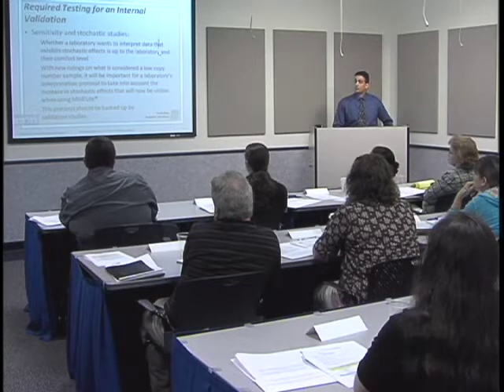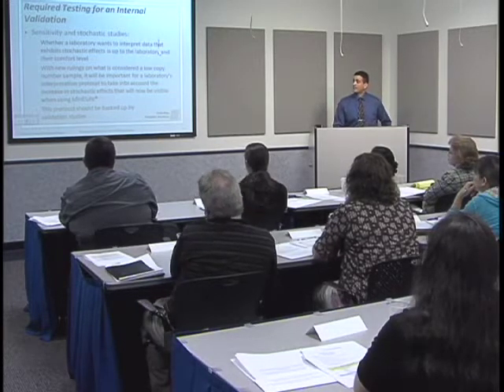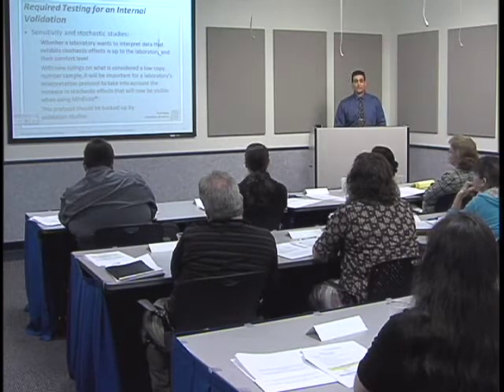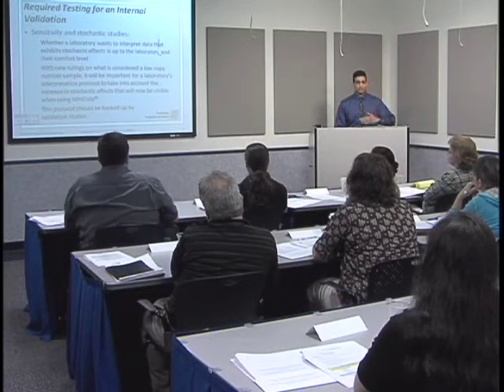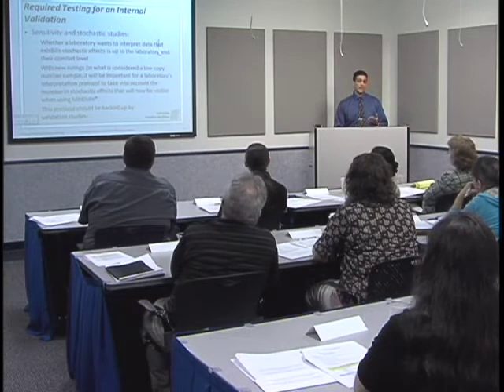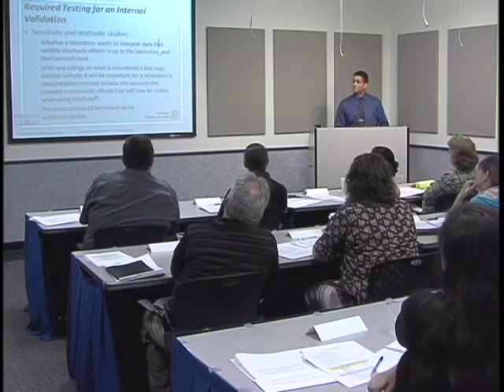Whether a laboratory wants to interpret data that exhibits stochastic effects is up to the laboratory and their comfort level. So that's, you know, depending on your laboratory, what you want to do. Some laboratories may only work with data that's perfectly clean. Some laboratories may be willing to interpret data that has peak height ratio imbalances.